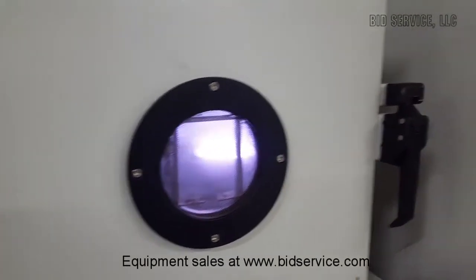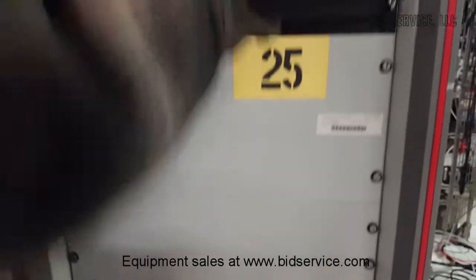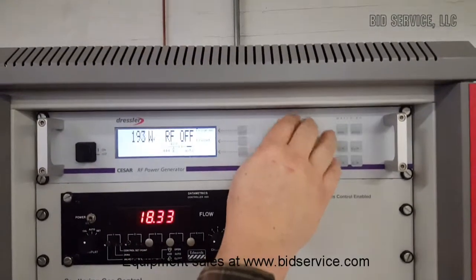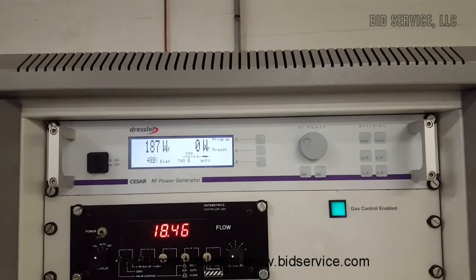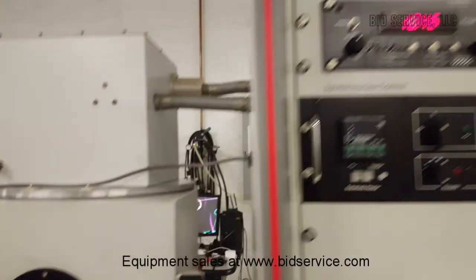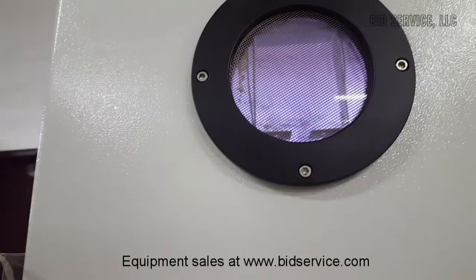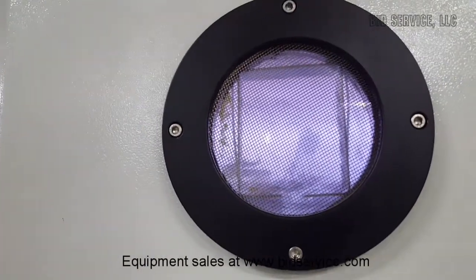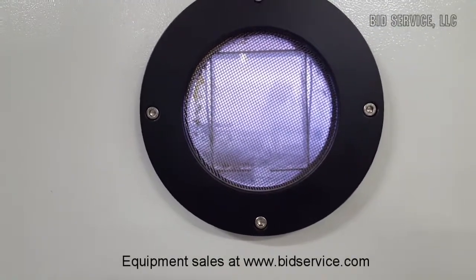And the last thing we're going to do now is an etch. So I'm going to shut it off, switch to 4, turn it down under 200, turn it on, and then you'll see the hue up top as opposed to any of the targets. You can see that's coming from the top down. And that's the end of the process.